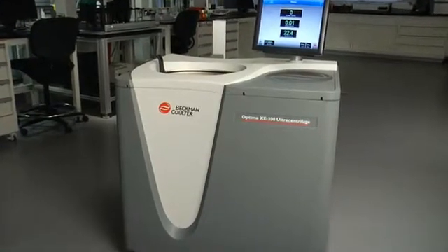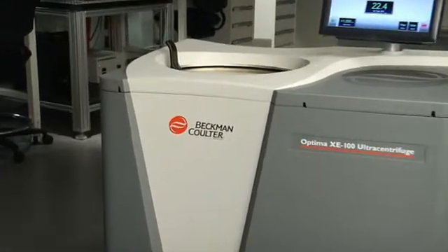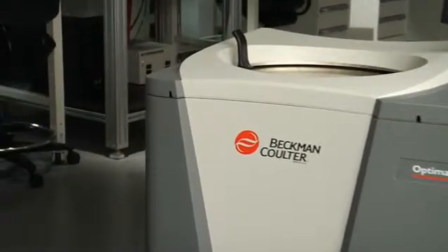Safety systems are as consistent as our instruments themselves. It's our commitment to keeping you and your samples safe and accurate.